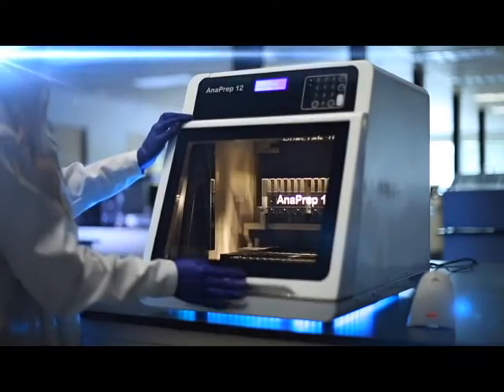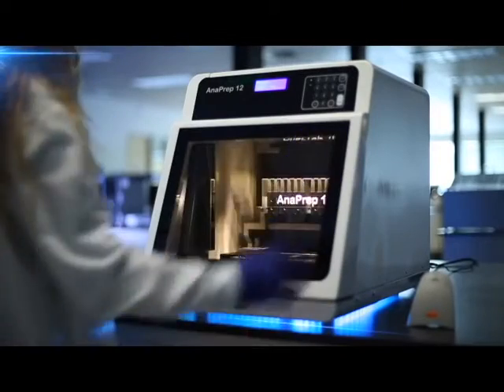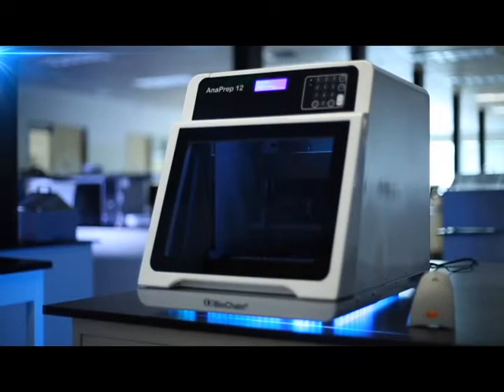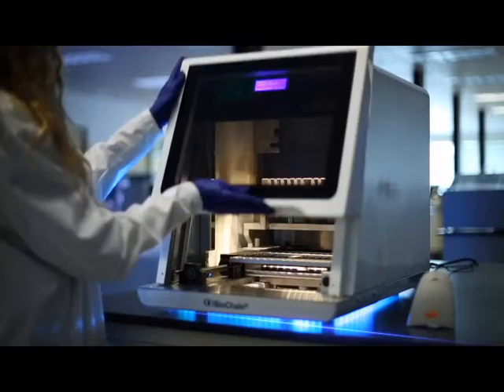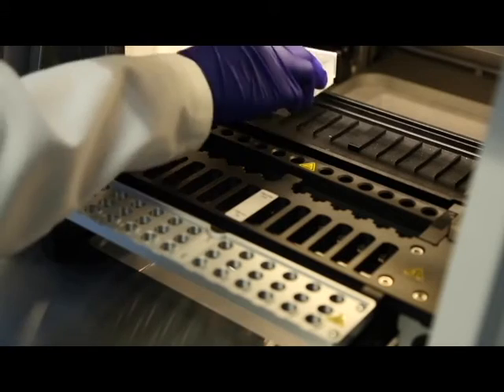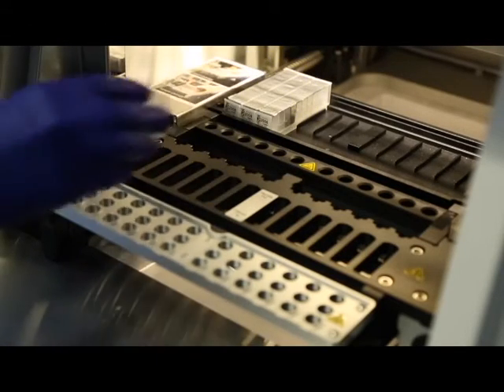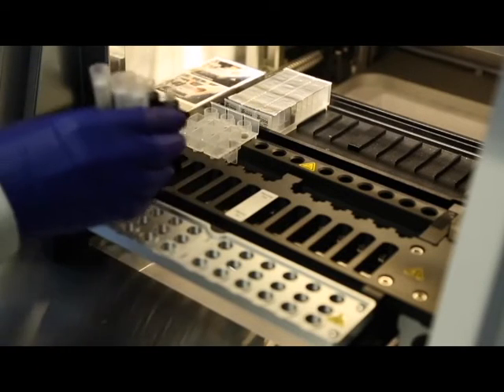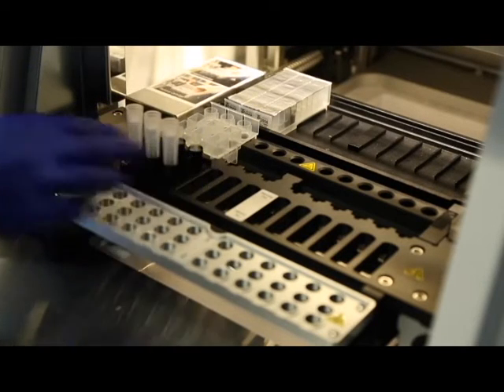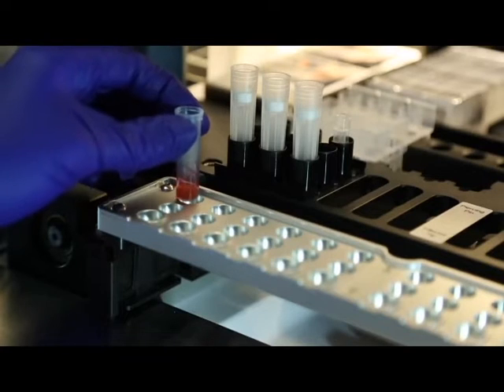This system has a sliding door located on the front of the unit, and is also equipped inside with a UV decontamination light. The Anaprep system is easy to set up and easy to use. Not only does it reduce your workload by eliminating the tedious processes involved with manual kits, it provides high quality nucleic acids.